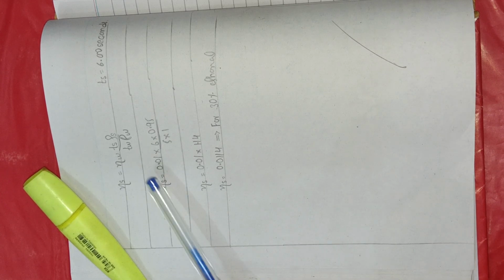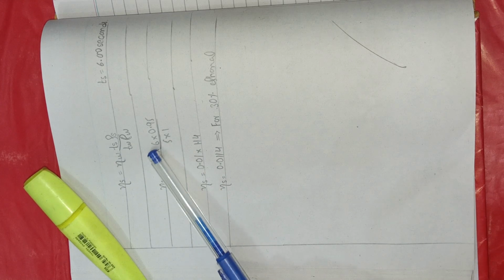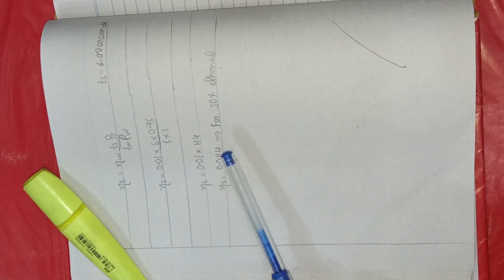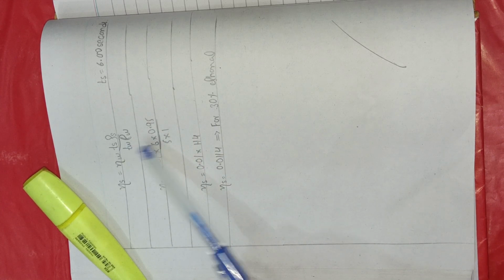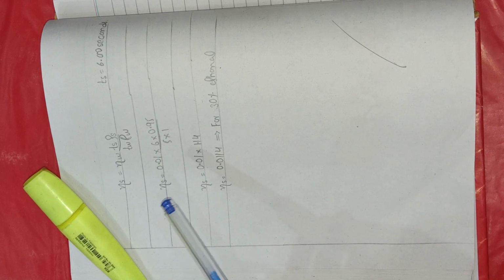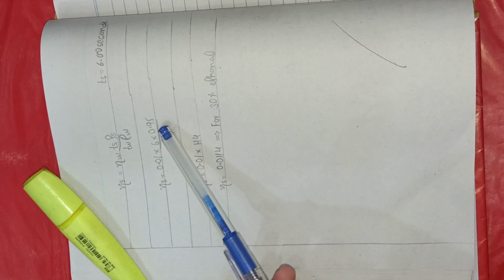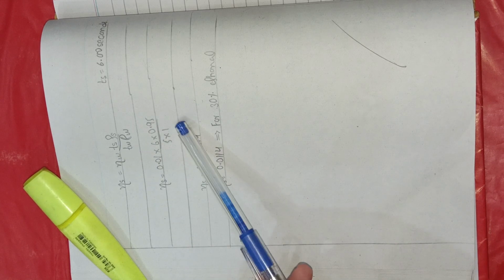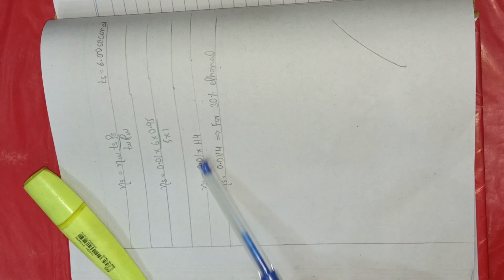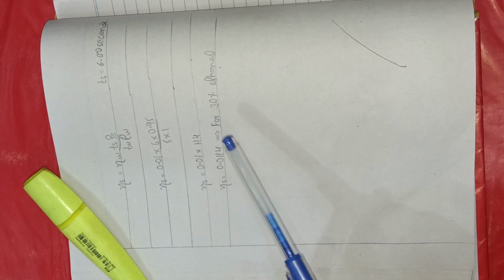So the viscosity of water is 0.01, and the time taken for that substance comes out 6 seconds. Water takes 5 seconds to move from A to B, and that ethanol takes 6 seconds to move from A to B. So here you can find out that ethanol is more viscous than water, and the density of that substance is 0.95, and the density of water is 1. So by putting all these values, multiplying and dividing them, you get the final answer, that is 0.0114. So this is the viscosity of 30% ethanol.